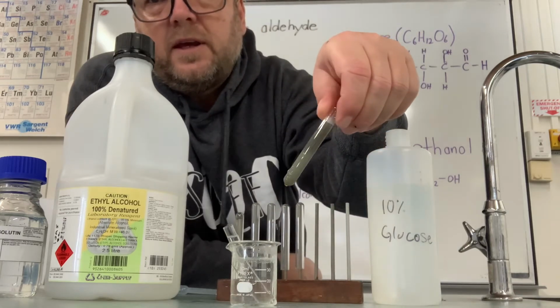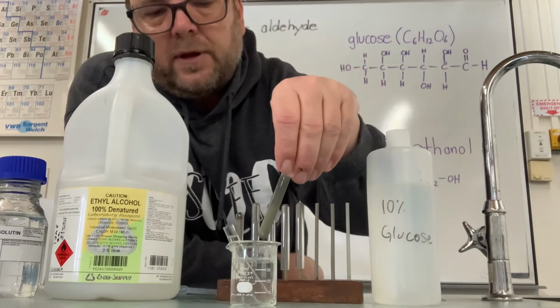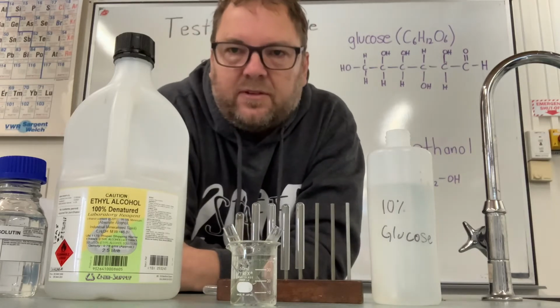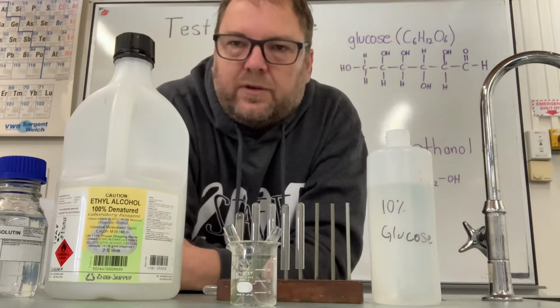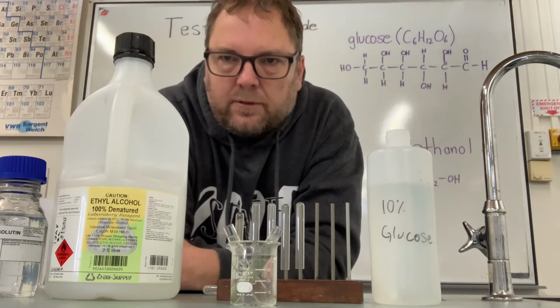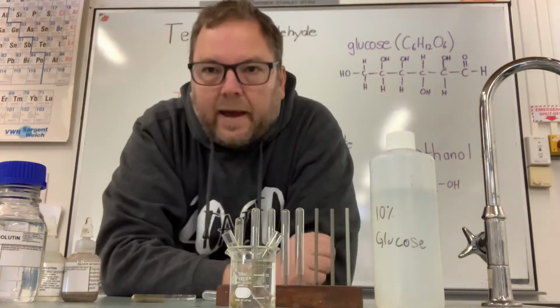You can see sort of more that grey colour, but if we leave it a bit longer, we should get that nice silver mirror form. The cleaner the glass is, the better the silver mirror that you get, but that's obviously enough for a positive test for an aldehyde. So I'll just pause again and leave that for a little bit longer, and we'll come back and see what it looks like. Okay, back again.